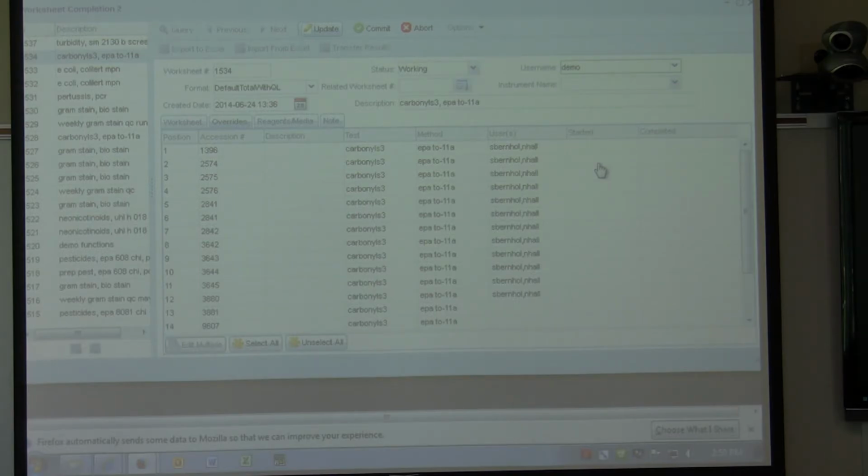We certainly have a QC start date. I think you added the users to the QC as well. So both of them should be available. I don't remember about the completed, but the started should have. They're all sharing the same fields now. So probably all three of them. Completed also has it now as well.